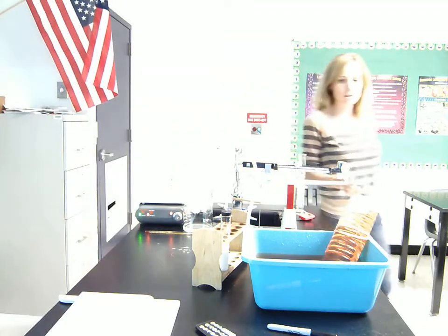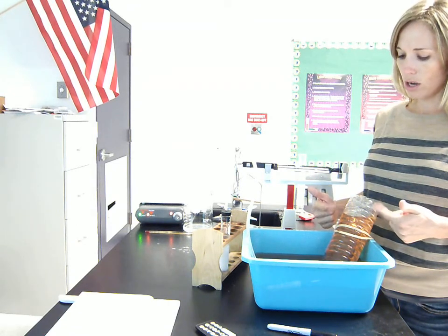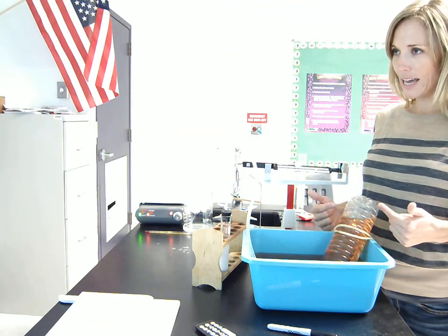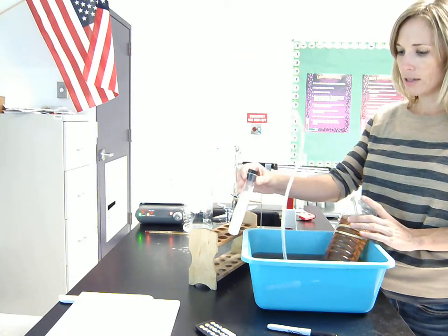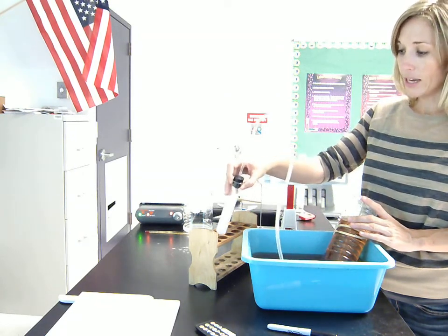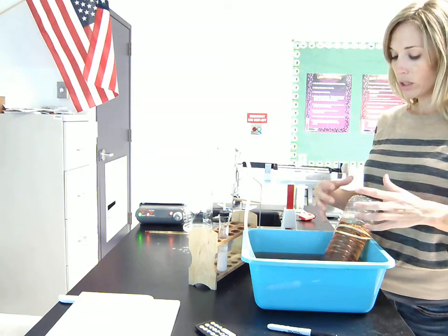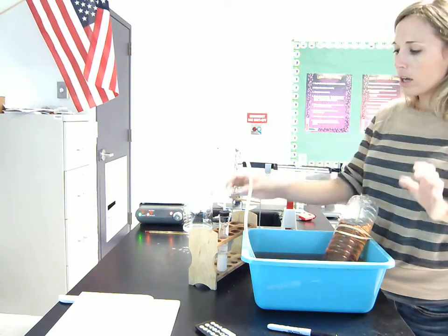So you can see right off the bat, actually if I can stand over here again, so you can see the backdrop of this a little bit. If I stand here, yeah, there we go. You can see just how much gas is being produced. I colored the water red so it'd be easier to see on the video, but it produces gas very, very quickly. And if you look at the test tube itself, you can see it's very fizzy and foamy, producing lots and lots of gas. And as it's doing so, the gas that we want to measure is being transferred over here so that we have it and it's contained and we can see it, sort of, in an indirect kind of way, and then hopefully get a good measurement at the end.